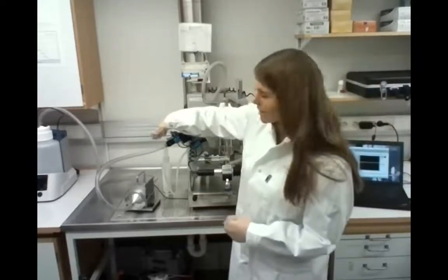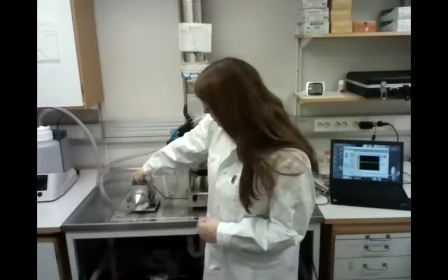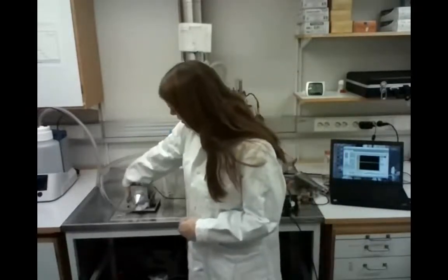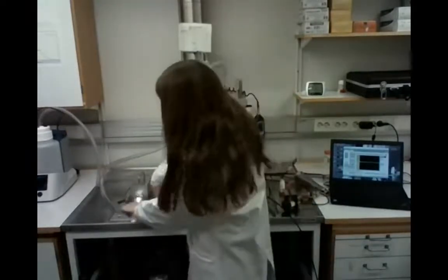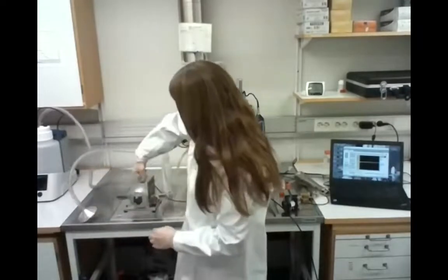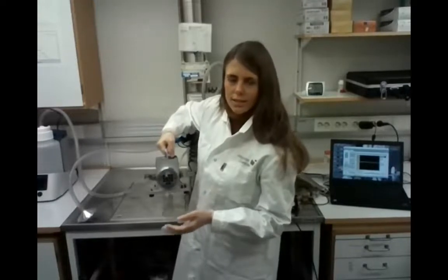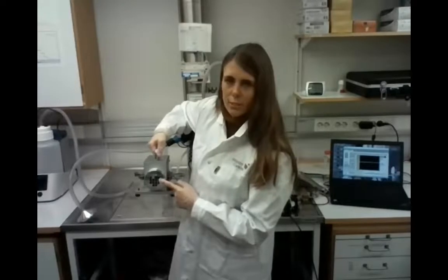So if we move on here, you can see that we have another part, and this is called the critical orifice. This orifice is used to regulate the inhalation flow. And this inhalation flow can be regulated with these plugs. So you can regulate it from 0 to 116 liters per minute by removing or inserting these plugs.